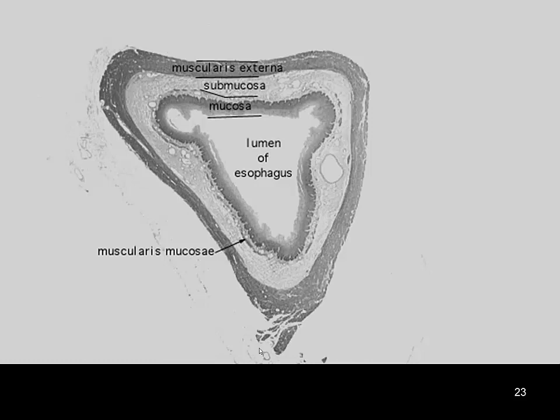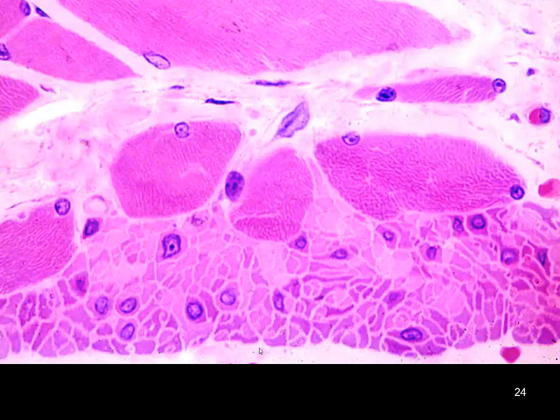All right, now looking at, again, some hollow organs. This is where we're going to find a couple of different muscle fiber types and muscle types. As we look at this, this is going to be a cross-section through esophagus. We will get to that when we study our digestive tract. But if you remember, the esophagus, at the very top third of the esophagus, that's primarily going to be skeletal muscle, where you initiate a swallow voluntarily. But then as you move lower and lower, you lower the proportion of skeletal muscle and increase the proportion of smooth muscle. So in this particular tissue, we're actually going to see 2 fiber types mixing and blending together.